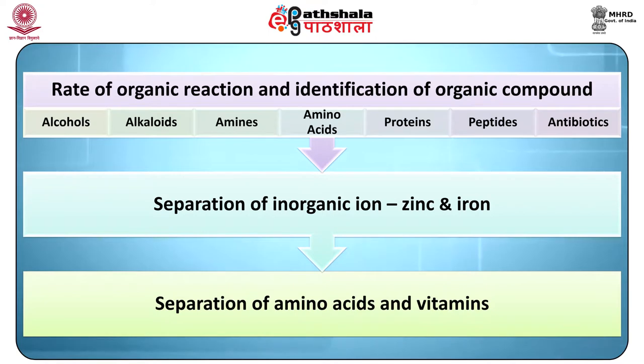Rate of organic reaction. Identification of organic compounds such as alcohols, alkaloids, amines, amino acids, proteins, peptides, antibiotics, etc. Separation of inorganic ions such as zinc and iron, separation of amino acids and vitamins.